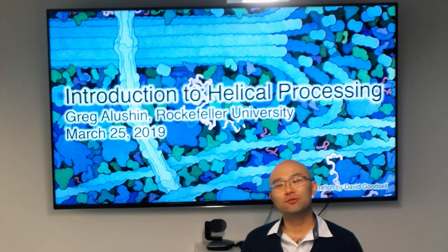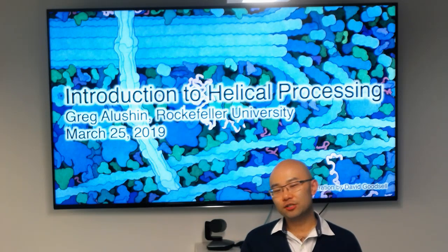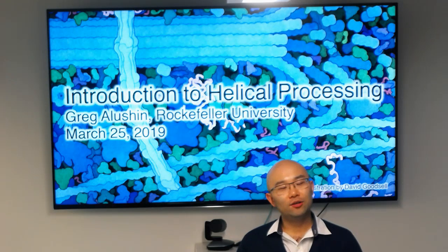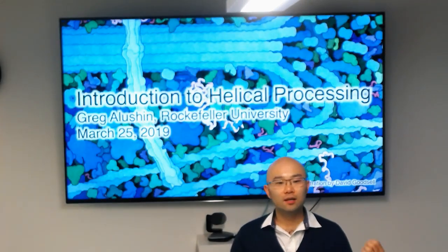Today we're well into our last modality of EM, and that's on if you can take your macromolecule of interest and form a nice ordered array. And you can see that the whole field has been getting a second wind in terms of single particle. That's been driving a lot of the advancements and giving more awareness to the other techniques like the tomography techniques and the ordered array techniques that we've been talking about yesterday, or rather last week.